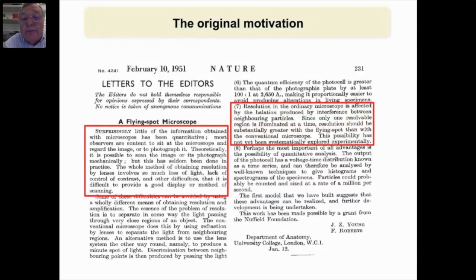Their point number 7 was one which got us particularly interested, where they say that the resolution in the ordinary microscope is limited by, well, they use the word halation, produced by the interference between neighboring particles, but they claim that in a scanning microscope, since only one resolvable region is illuminated at one go, one ought to be able to improve the spatial resolution. This possibility has not yet been systematically explored experimentally. It now has. So this is really what fired our imagination to start off with.